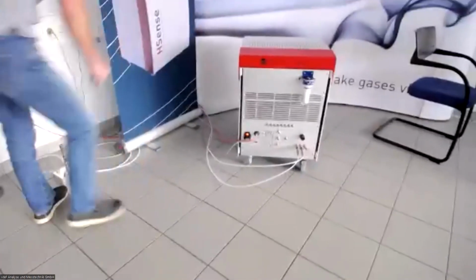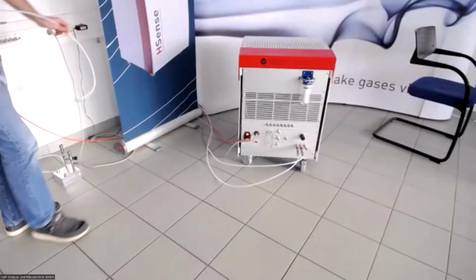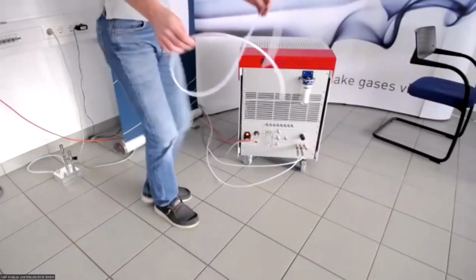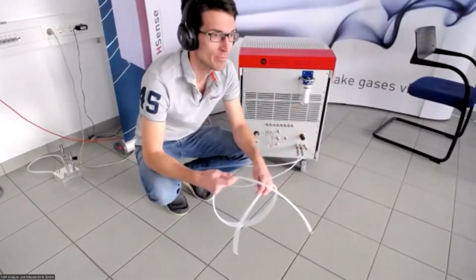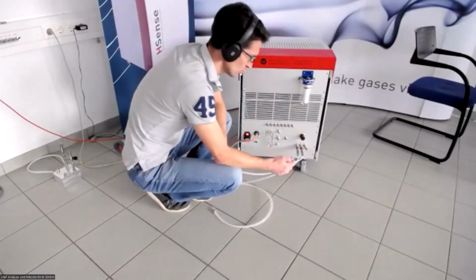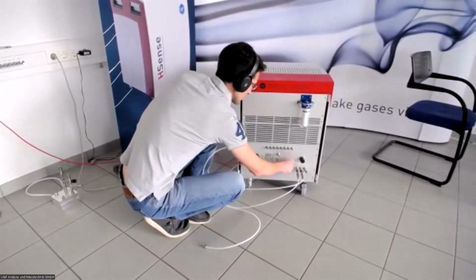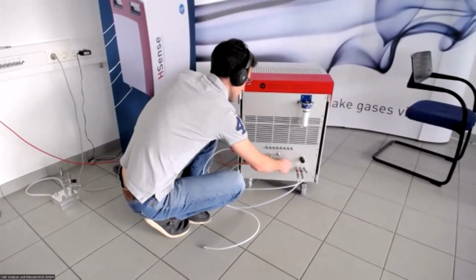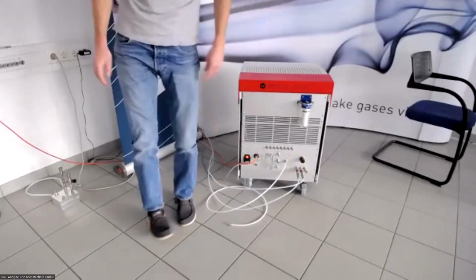Since we are running pretty much on dry gas, we are going to use the most simple sample line that we can get, which is just a piece of 1/4 inch Teflon. We're just going to attach that to our sample line inlet. This is where the gas for analysis during sample with pump will be drawn in.